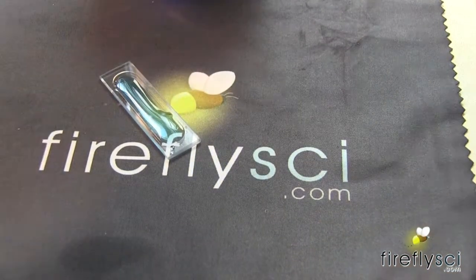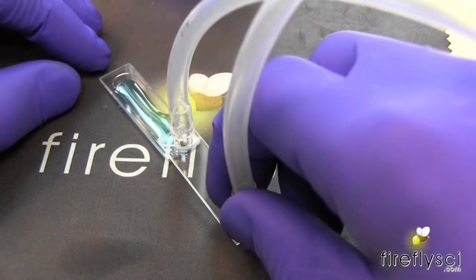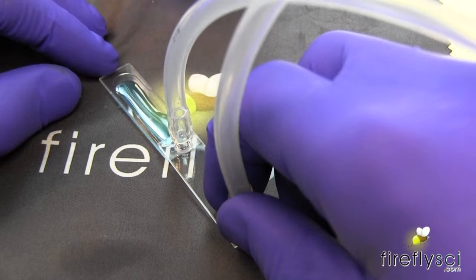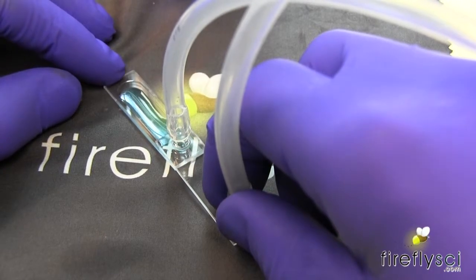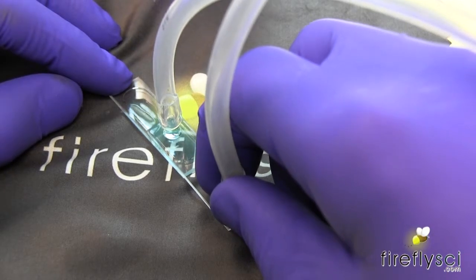And now I'm going to put the cover plate slip on, starting at one end here. Making sure that there's no air bubbles and just sliding it up.